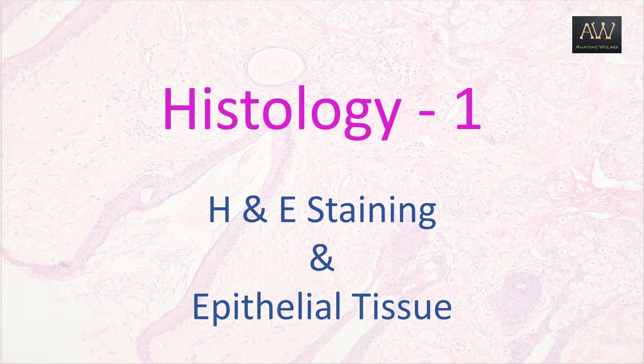Welcome to this video on practical histology in which we will have a brief introduction to H&E staining and then take a look at the basic structure and nomenclature of various types of epithelial tissues. So let's get started.